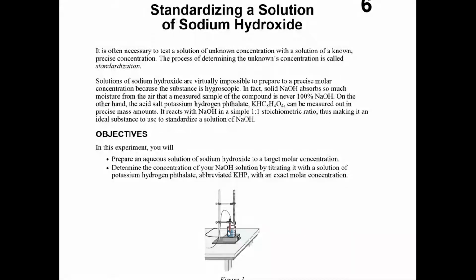In this lab, you're going to be standardizing a solution of sodium hydroxide. The reason we need to do this is because sodium hydroxide is hygroscopic. Let's talk about what that means.